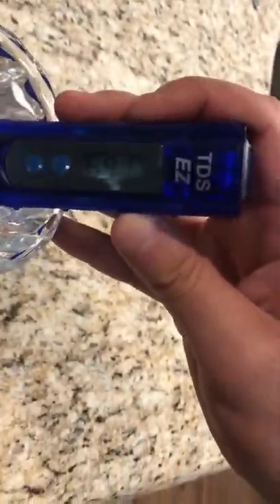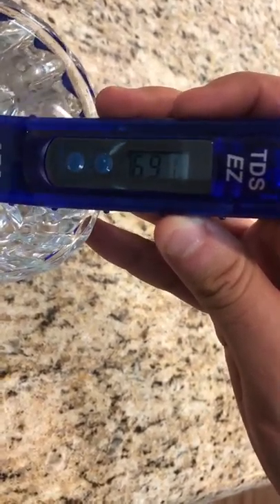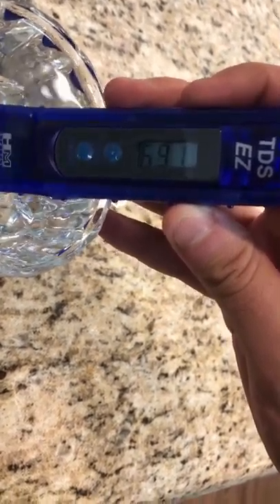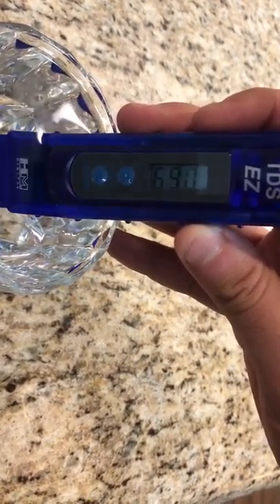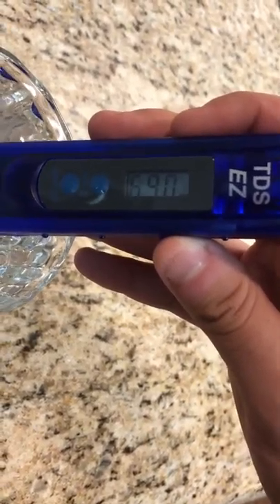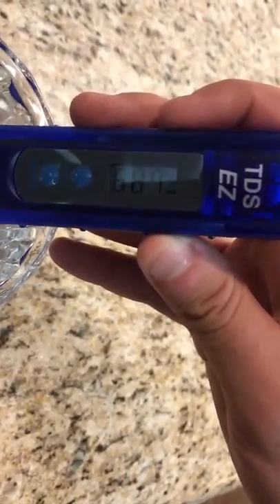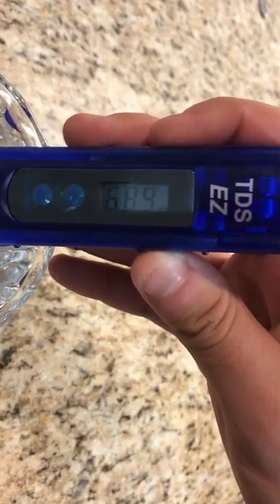The reading already reads 691 parts per million, which is outstandingly high, and this should serve as enough proof that the tap water is contaminated and extremely harmful to human health. The chart on the back states that marginally acceptable tap water is between 200 to 400 parts per million — as you can see, this isn't even marginally acceptable. It's 689 parts per million.